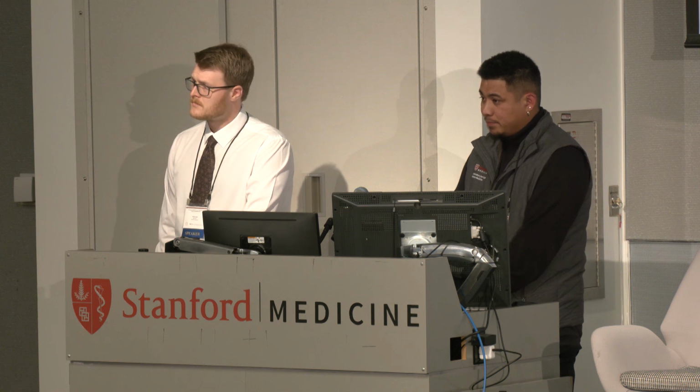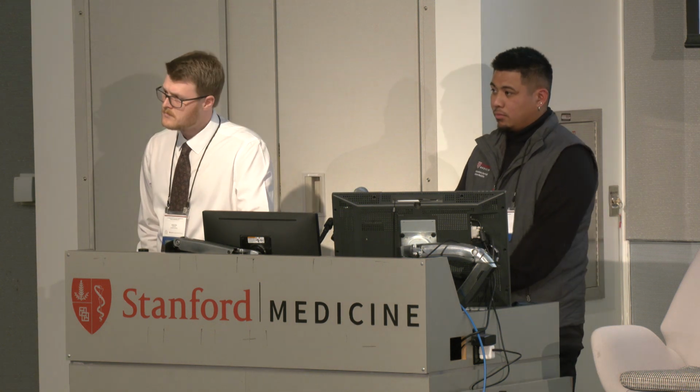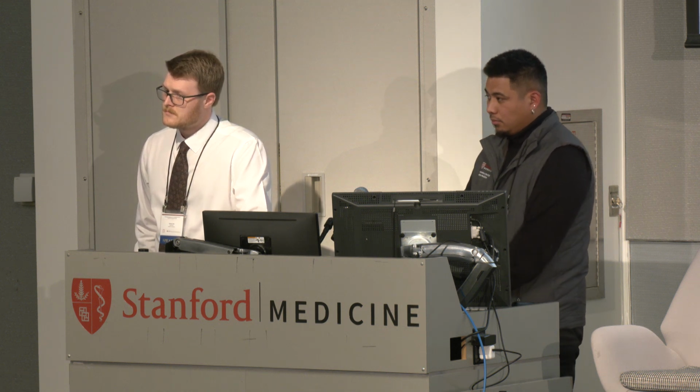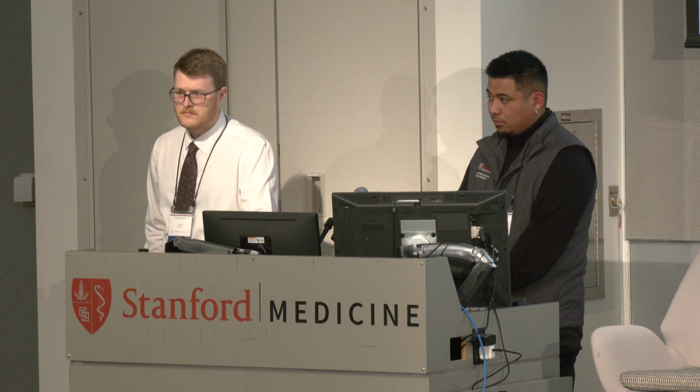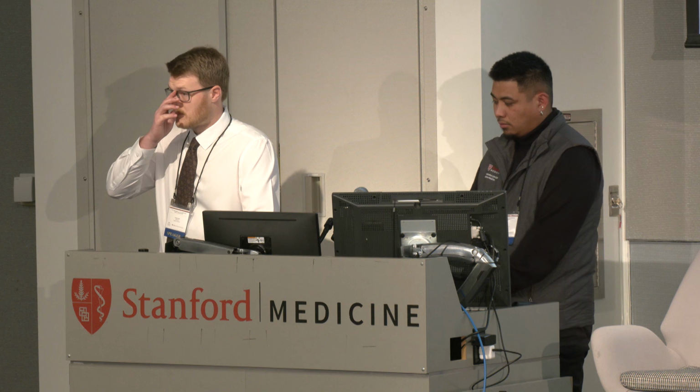So the question is, the team has a very good alpha beta depletion, but we can never get CD19, CD20 depletion as well as on the CliniMACS as you did, Nick. So what can they do to improve the CD19 depletion in general?